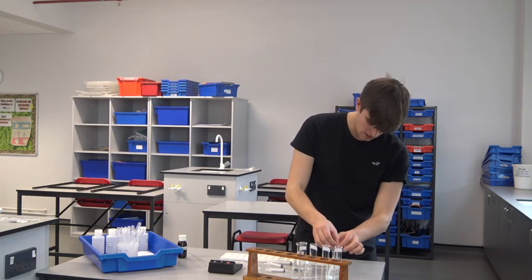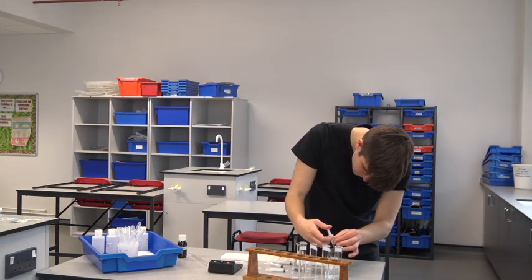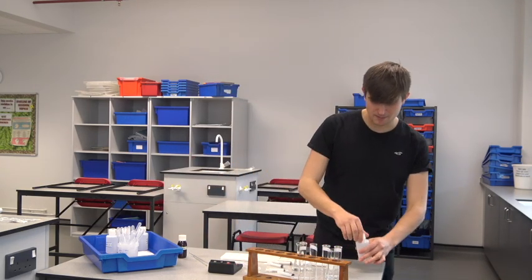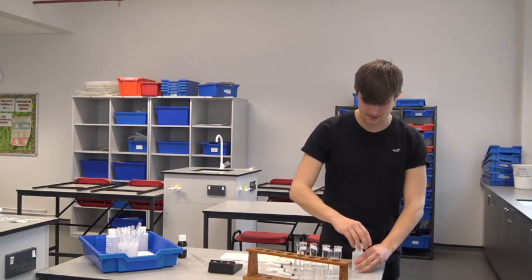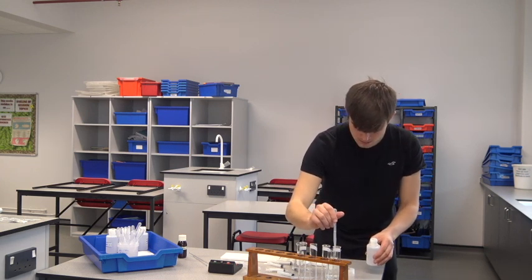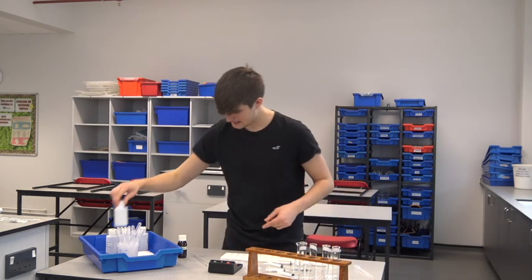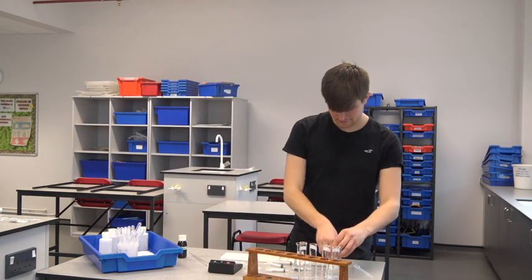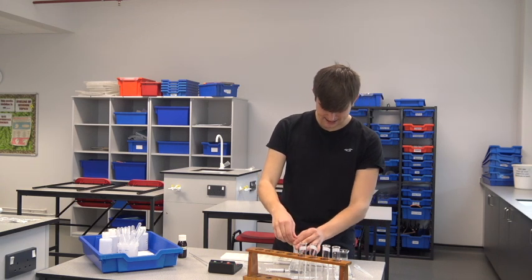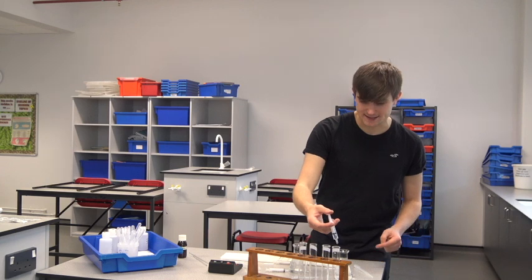I'm going to measure out using a syringe to make it incredibly accurate. Let's get two millilitres of my amylase. Next I need two millilitres of my buffer solution — this is my pH 3 substance, so it's highly acidic. And then finally I'm going to add two centimetres cubed of my starch. As soon as I've done that, I start my stopwatch and take my first reading.